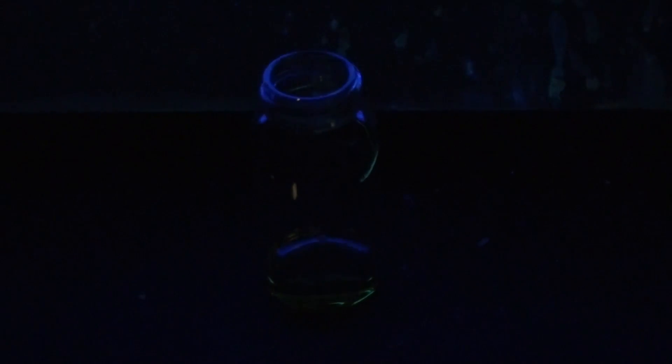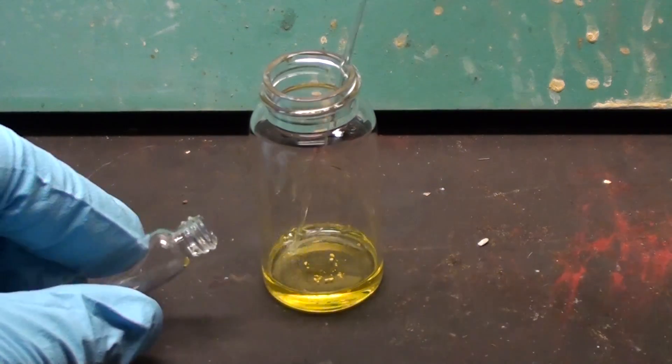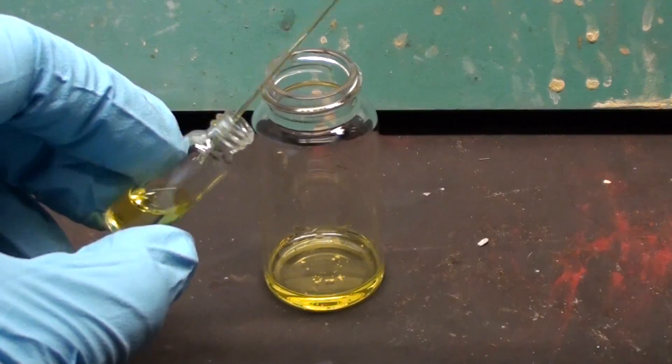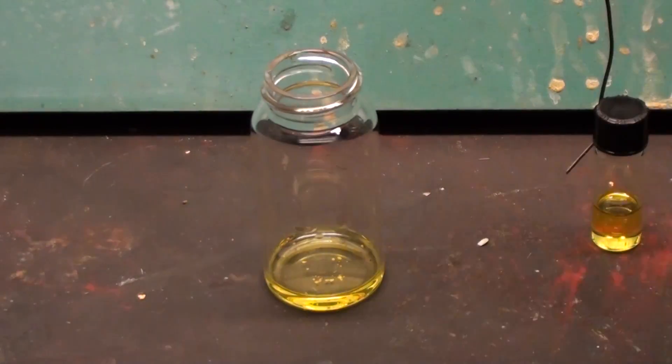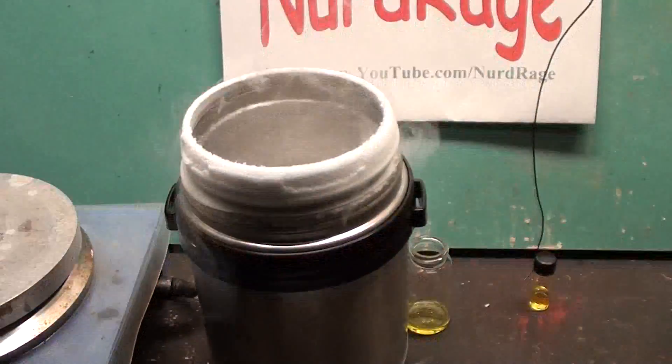Now normally this solution is not fluorescent at room temperature, but let's see what happens if we put it in liquid nitrogen. First let me pour some into a smaller vial so it's easier to handle, and I'll attach a wire.